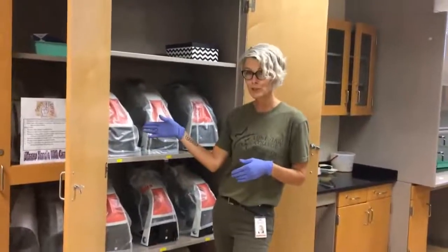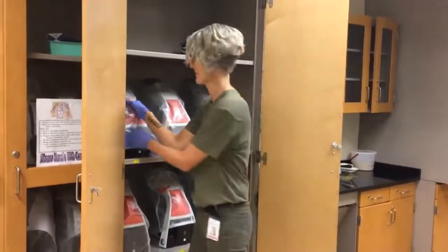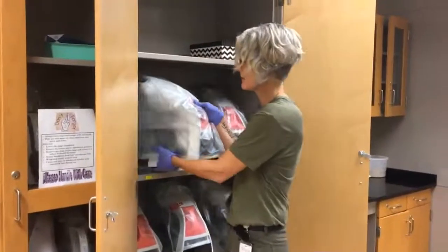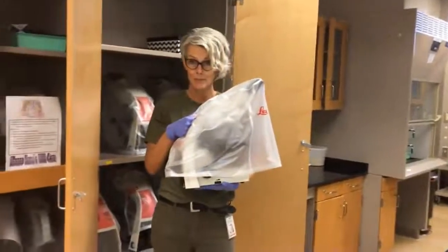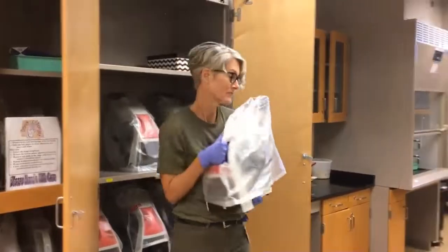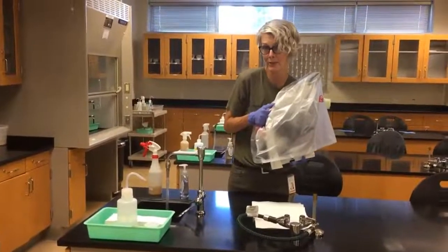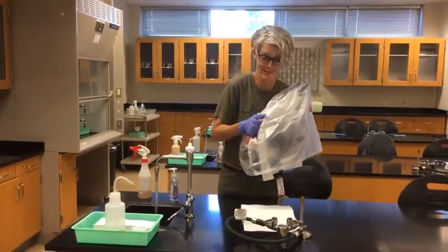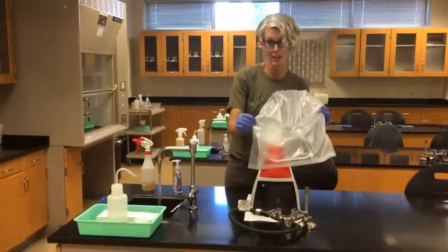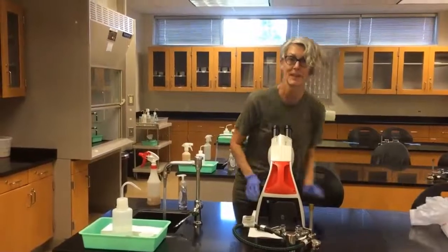When you go to take the microscope, you're going to grab it with two hands. There's a handle on the arm. Lift it carefully out of the cabinet and support the bottom, the base, with your hand. Hold it close to your body and walk to your seat. Once you get to your seat, you're going to lay the microscope gently on the little mat that you've prepared for it.